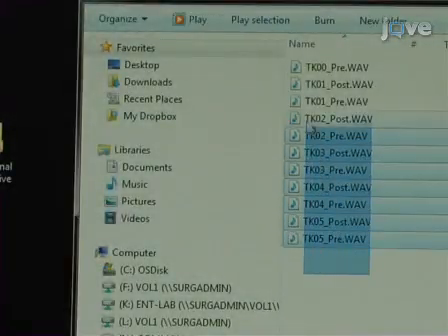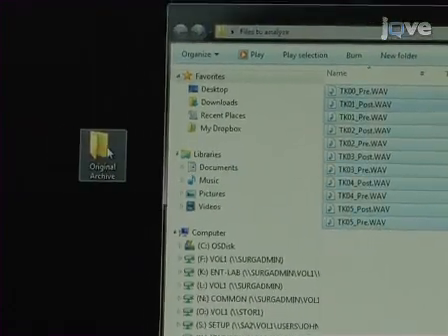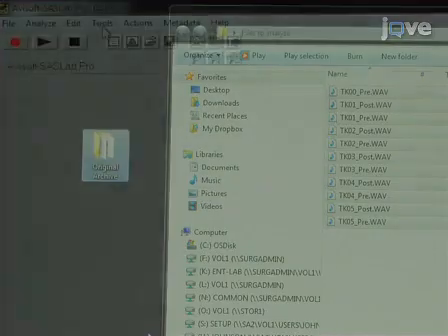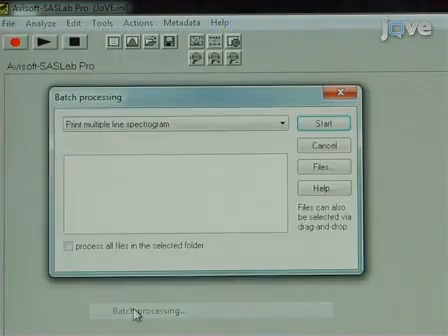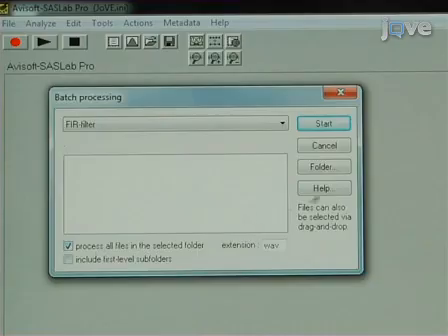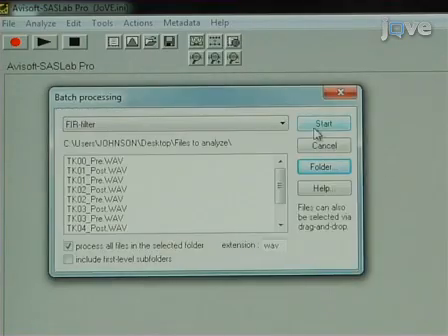To analyze the baseline and post-training recordings, first generate an archive of the original sound file and make edits on a working copy. To remove noise at frequencies below the ultrasonic vocalizations, use the batch mode of Avisoft SASLab Pro to high-pass filter all sound files at 25 kHz.